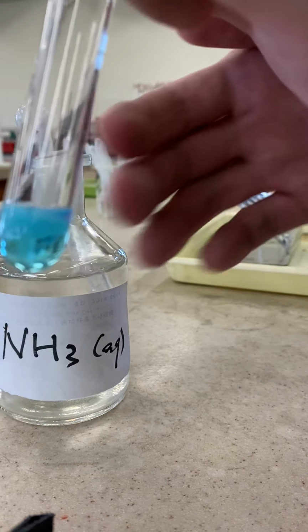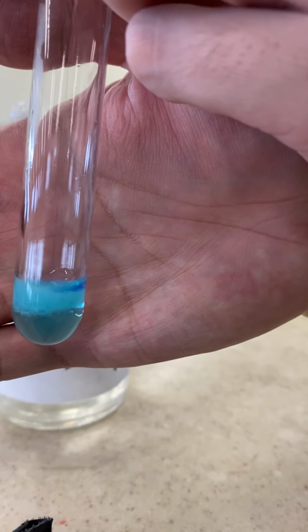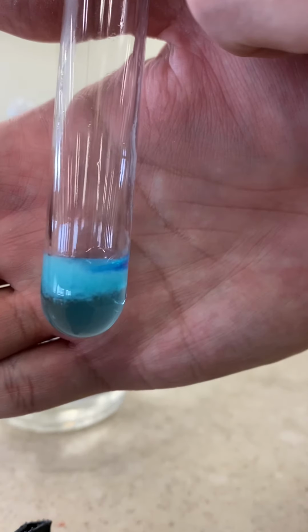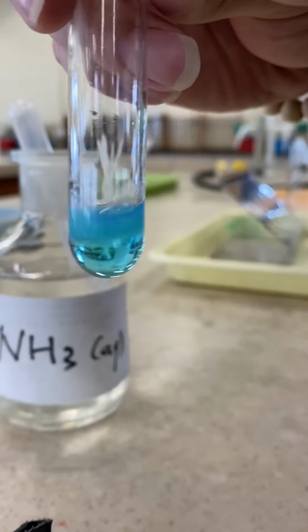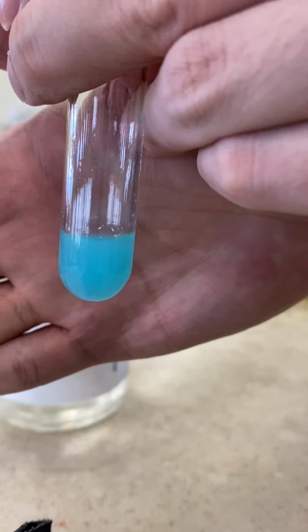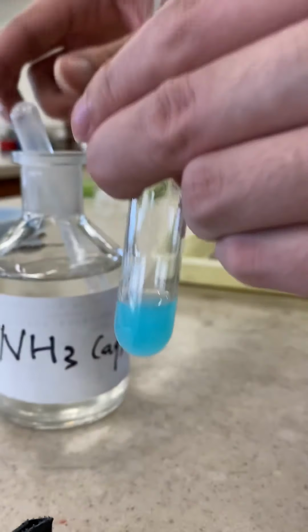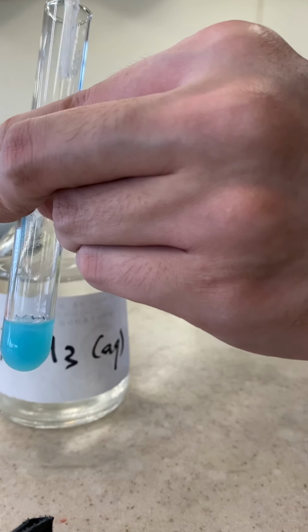I think you can see something already. Originally, it's a clear solution, and now there is some pale blue solid forming on the top. So let's shake it a little bit. And then it becomes a milky blue color. So let's try to add more ammonia inside by drops.